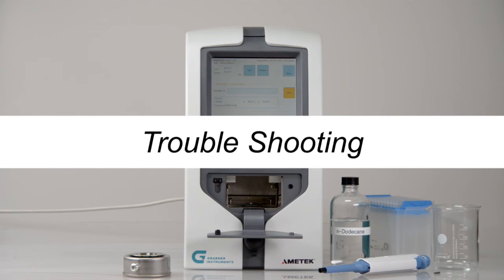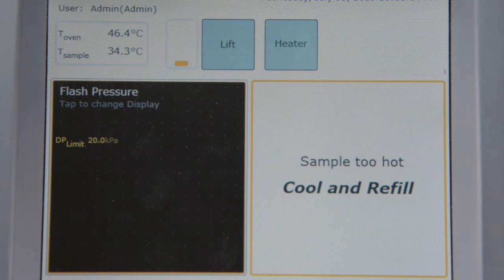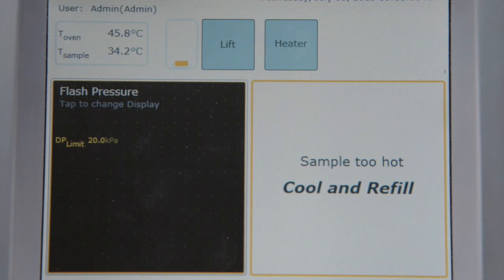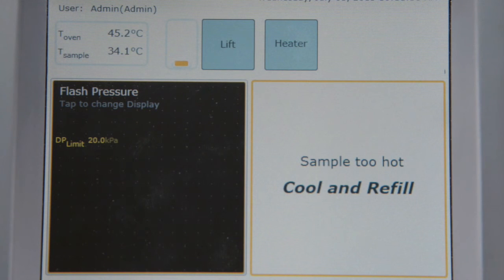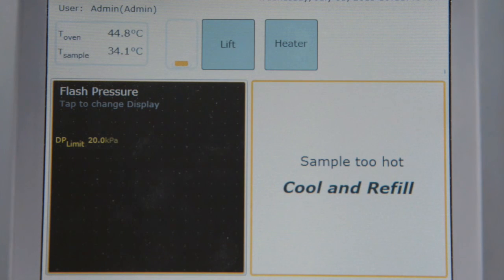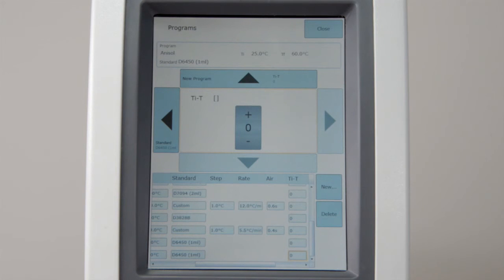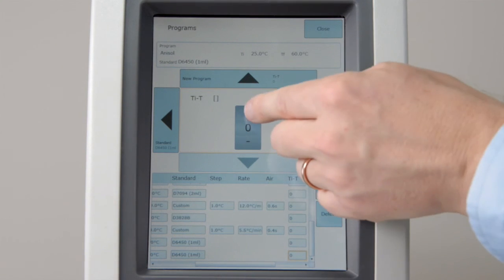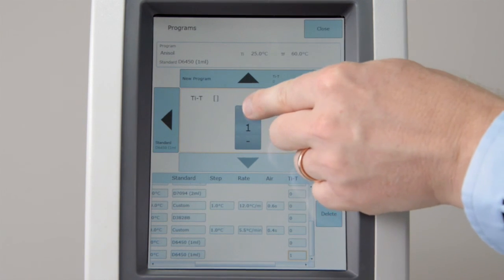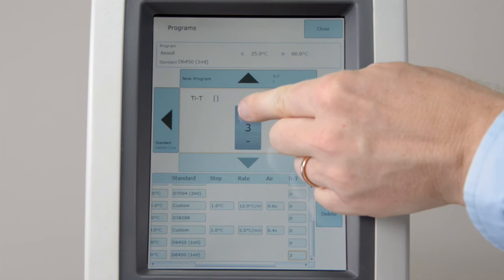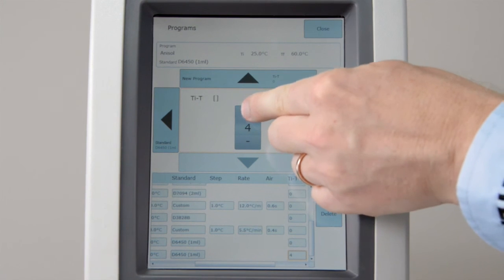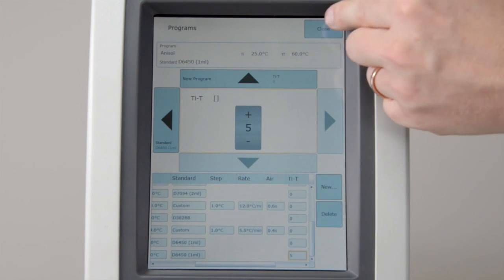Troubleshooting. If the sample is too hot, a warning Cool and Refill will show on the instrument. Please cool the sample. Set a TIT value to lower the oven temperature. Then restart the test.